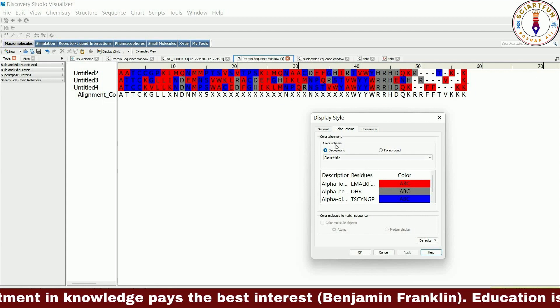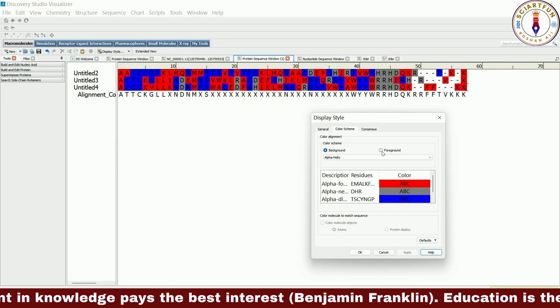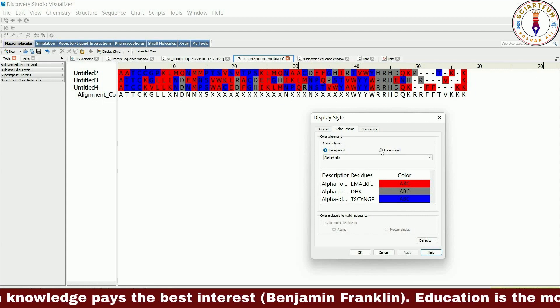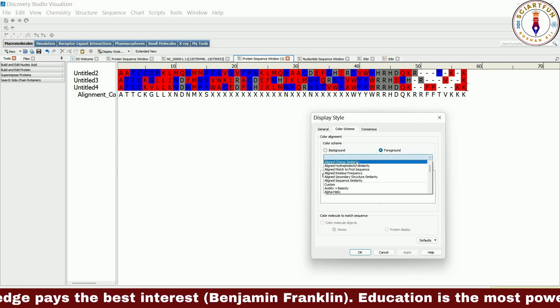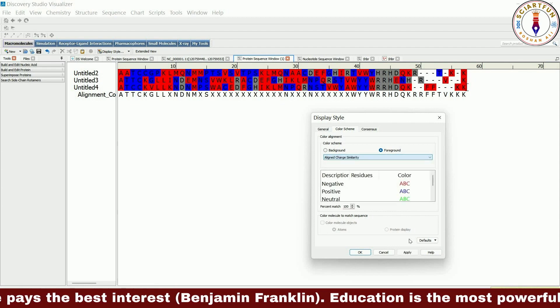The foreground option will only change the color of the text, not of the background.